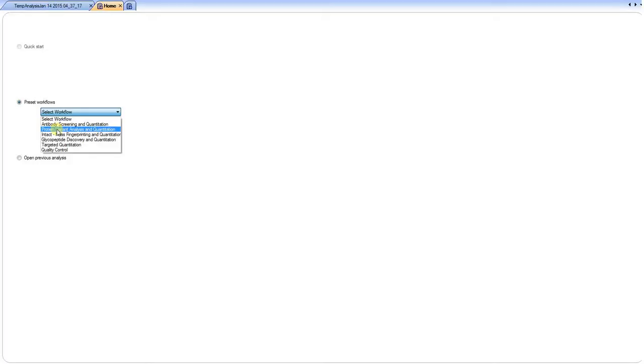digest under study is relatively pure and there's a low background matrix. The video will be broken up into two aspects: the first is how to set up and search for SNPs, and the second is how to review the data for SNP verification in the sequence.